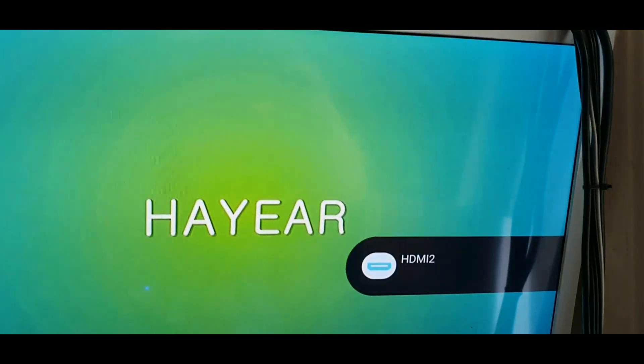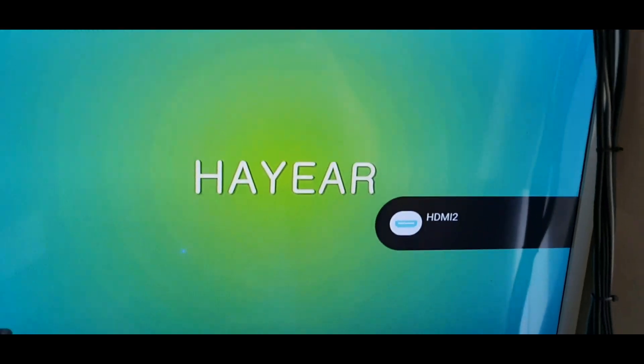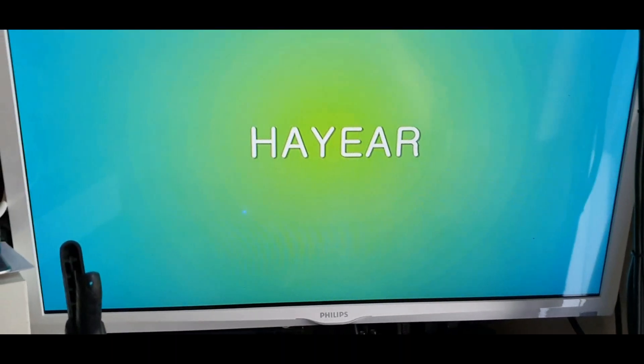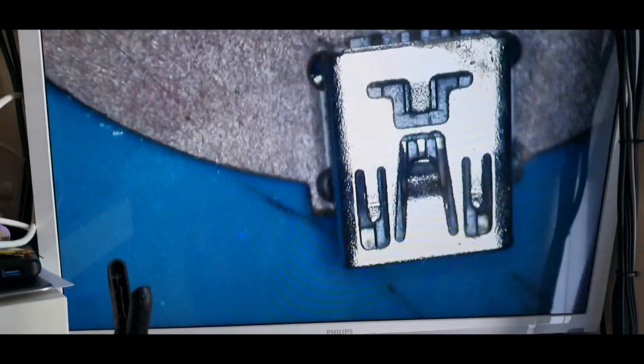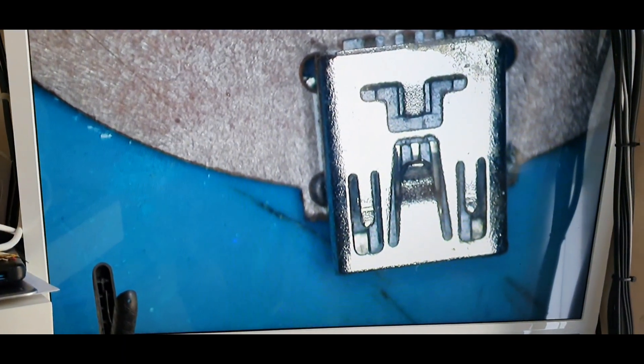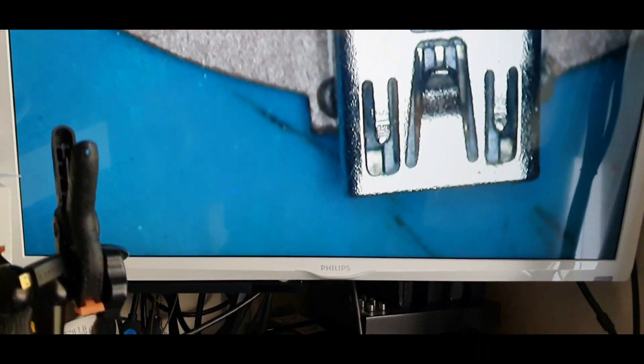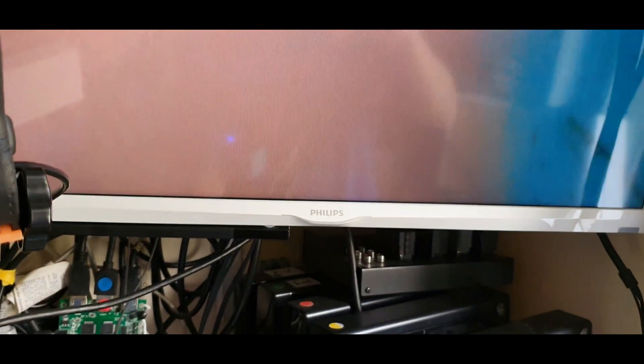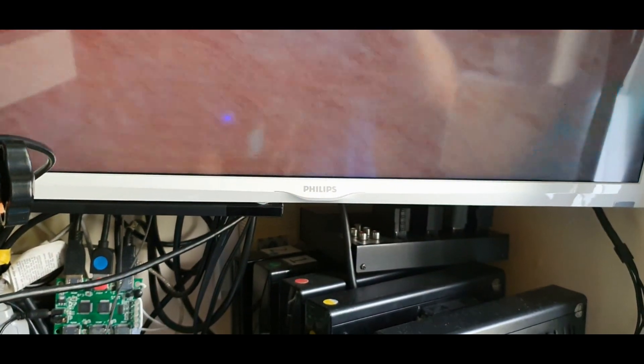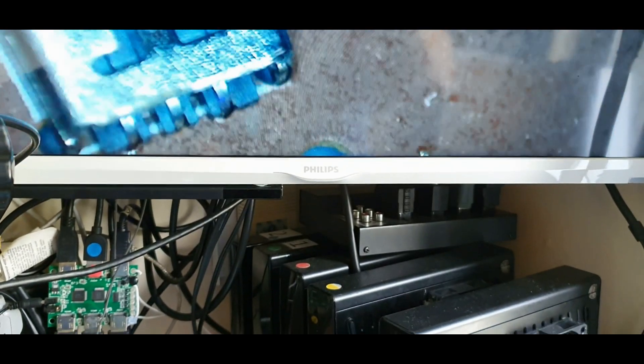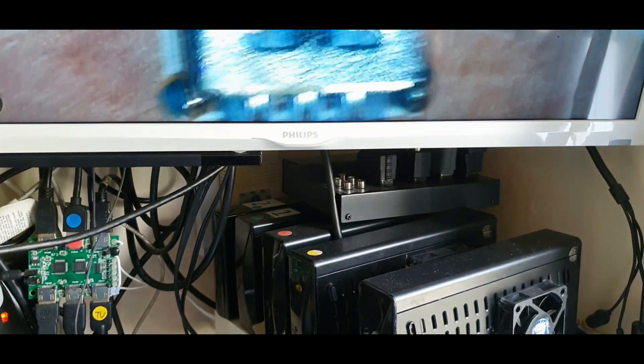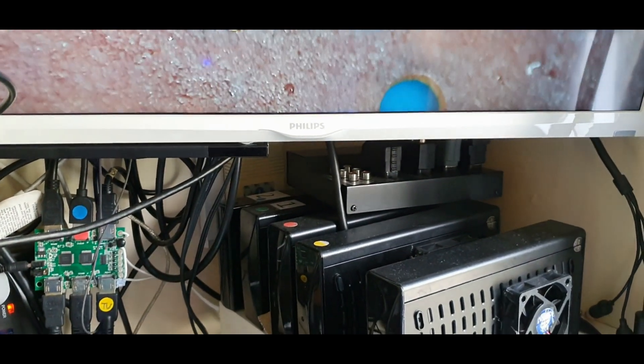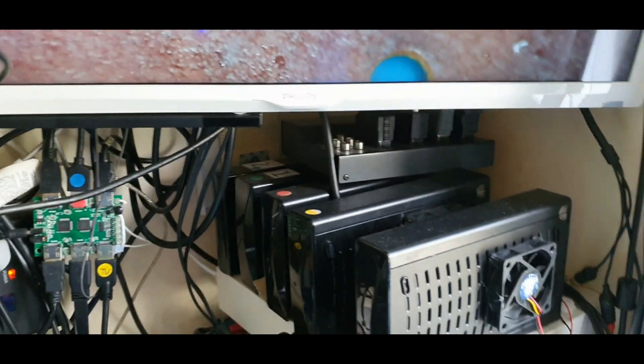Okay, lights coming on. I'll turn it up. I'll turn it upside down.